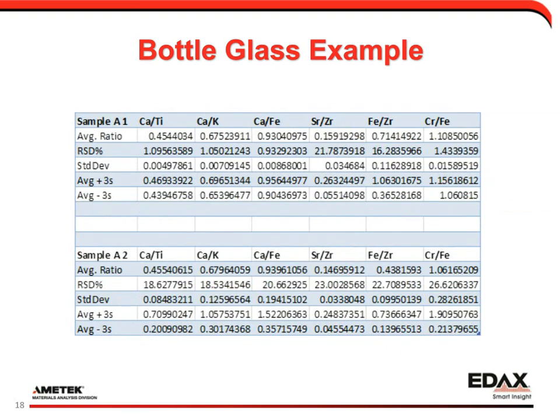After those results have been normalized, we can calculate their intensity ratios, or their internal ratios. These ratios are defined in the ASTM method, and most of them work out very well, but in some instances, as I mentioned in my particular case with magnesium, that was taken out because it did not satisfy sufficient signal to noise.